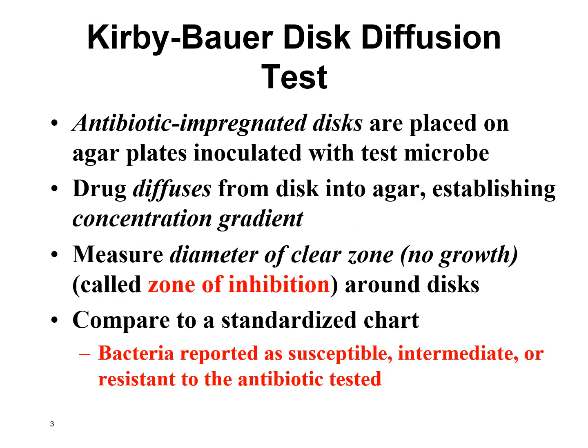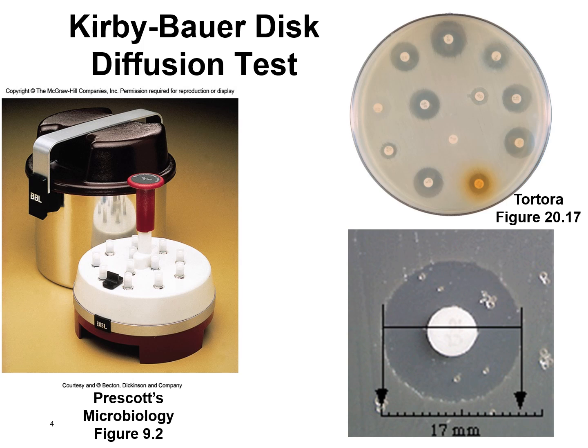And then the third way that we can determine the MIC is called the Kirby-Bauer disc diffusion test. So we'll just take the bacteria from the patient's culture sample and grow that in our Petri dish. And then we'll place these paper discs with a particular antibiotic on it onto our Petri dish. And we have a little spring-loaded machine here that will place the discs onto the Petri dish for us. And this way we can test multiple antibiotics at the same time against this patient's bacteria.